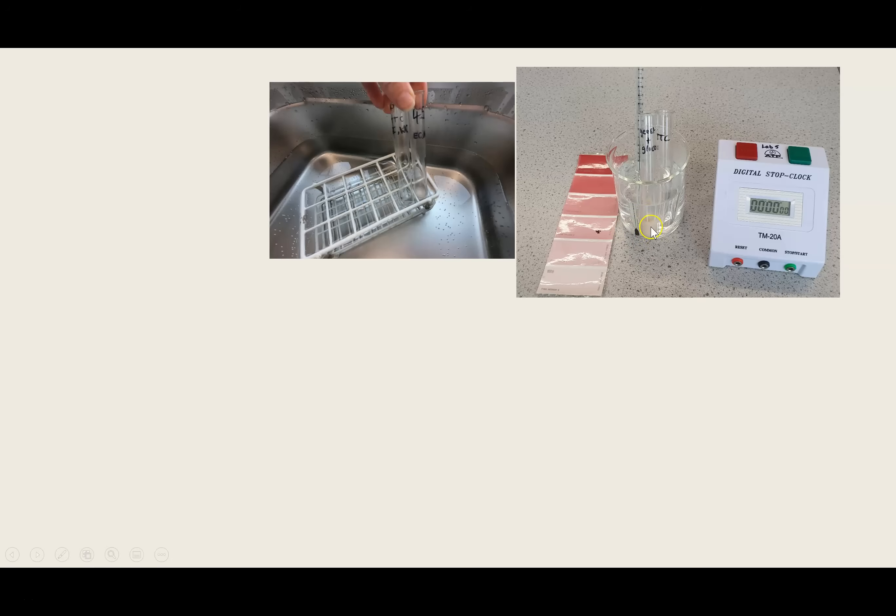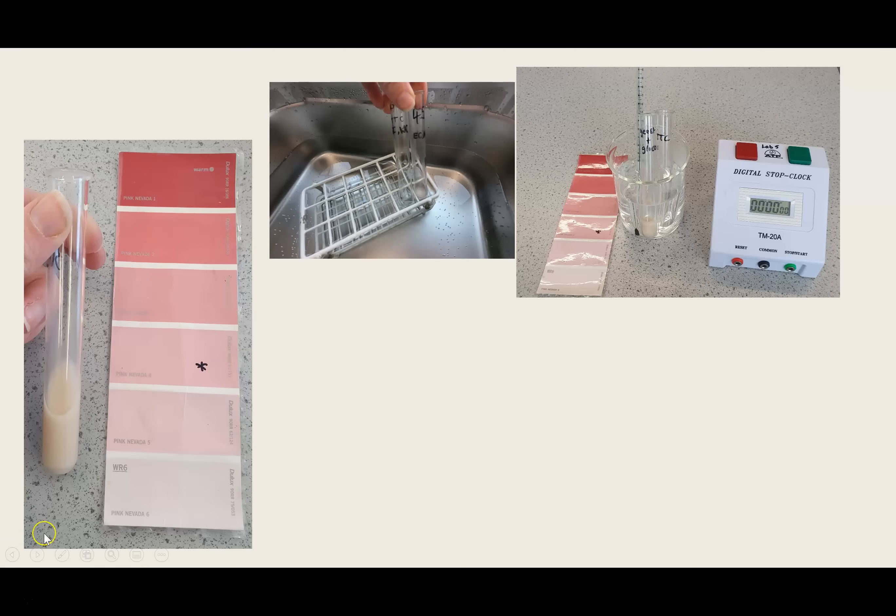If you mix creamy, yellowy, beige with red, you actually end up with pink. So I've starred this particular shade of pink to be consistent. I'm going to say when the color reaches that point, that's when I'm going to stop timing. So I'm standardizing the method - we'll stop the stop clock at the same end point for all the reactions. I've got a thermometer handy to check my water bath and the temperature of the two test tubes is equilibrated, and then I'm going to mix them together.